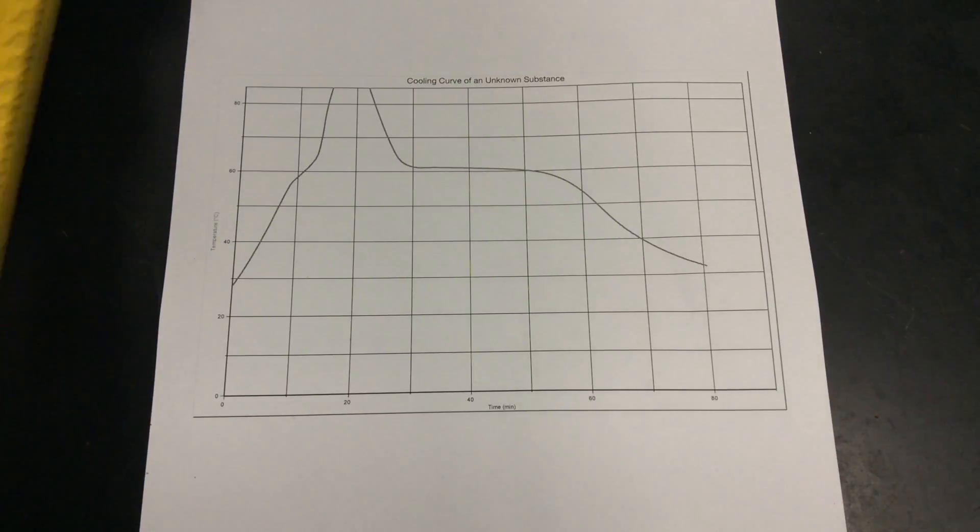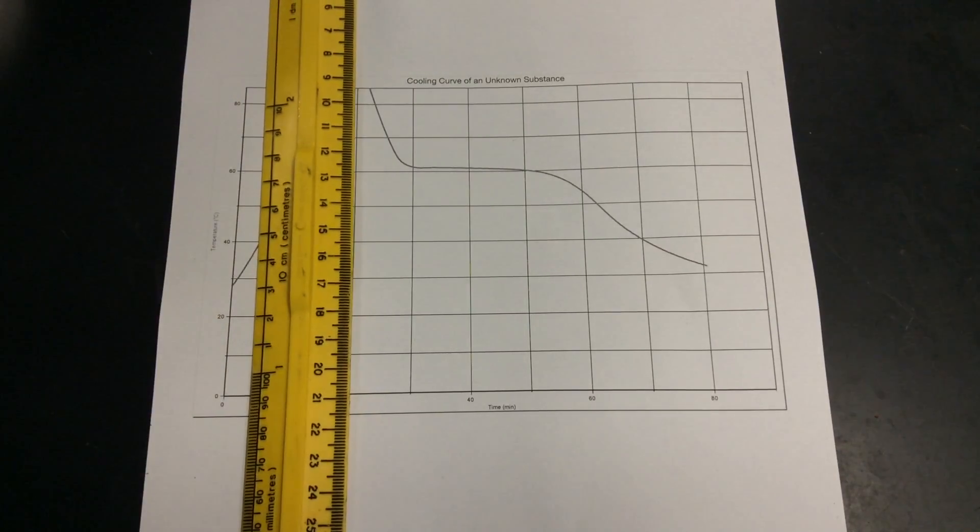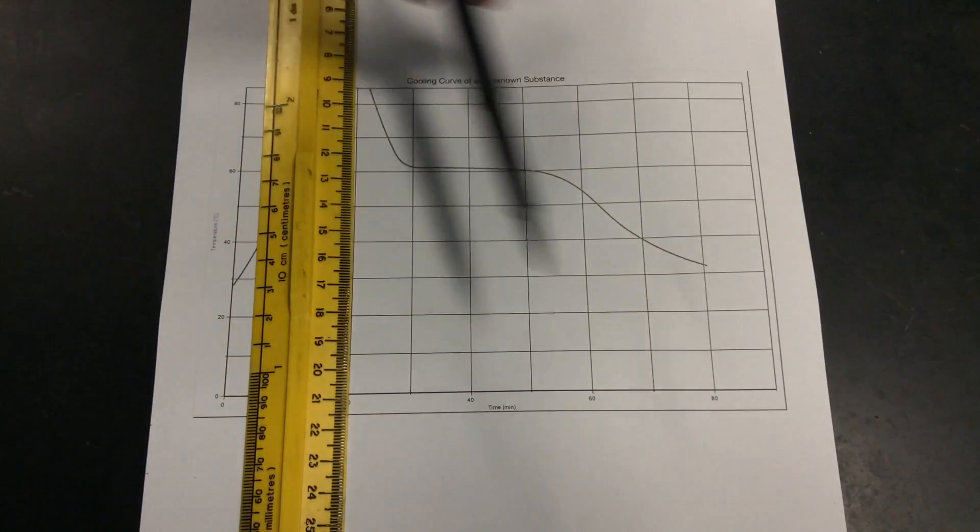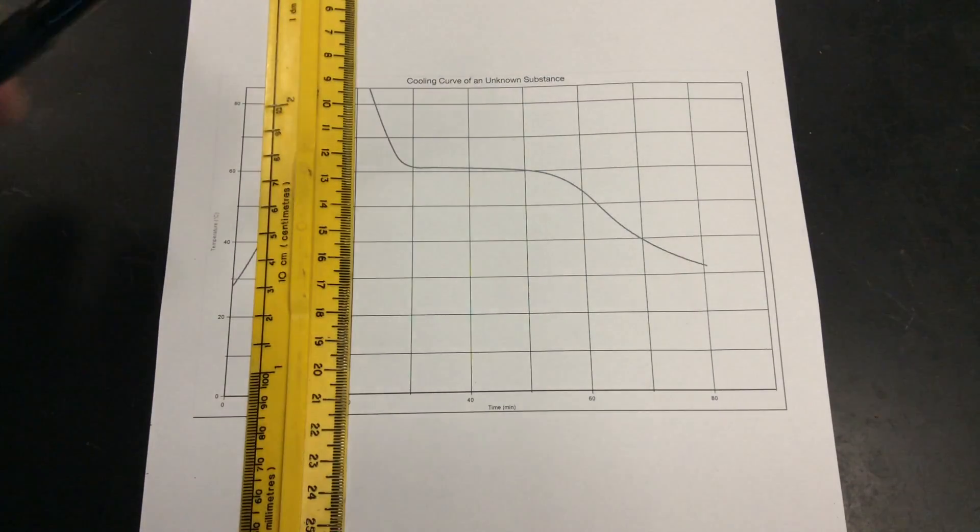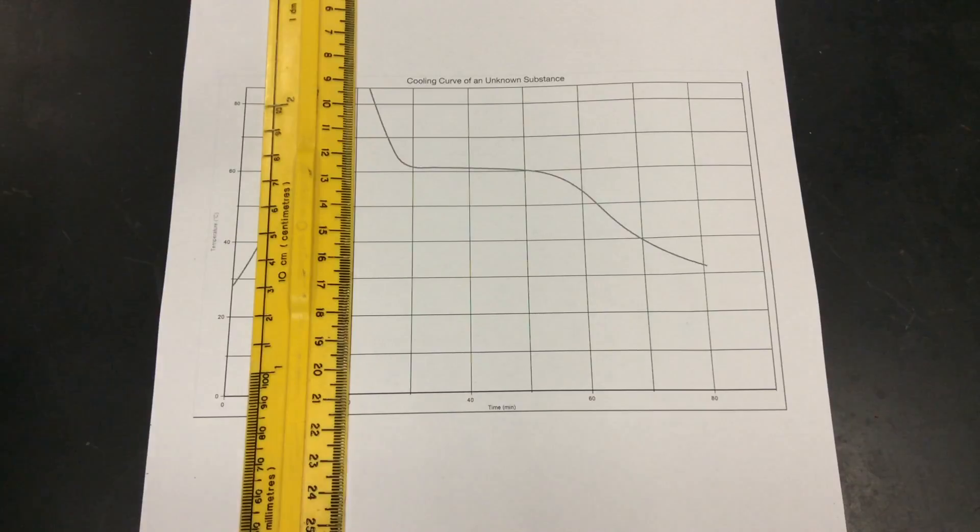Really to get our data here, we should be focusing on this part of the graph. Notice that we did not measure the temperature of the gas, nor did we boil the liquid. We don't have the liquid to gas phase change, so we're eliminating that. All we have is liquid to solid.